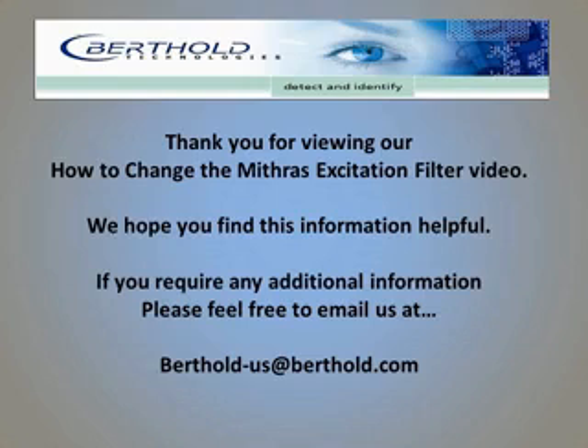And now you've successfully installed a filter in the excitation filter slide. Thank you.